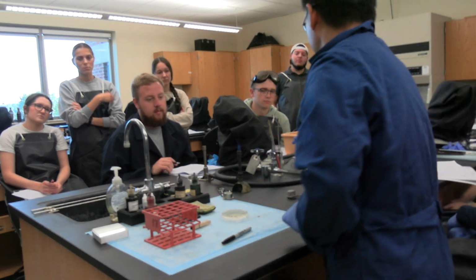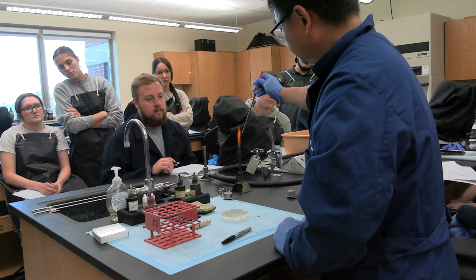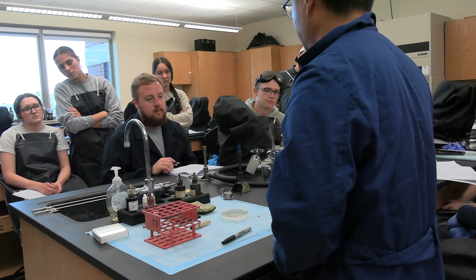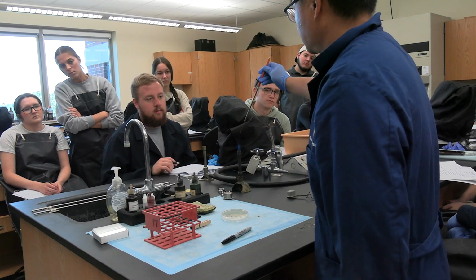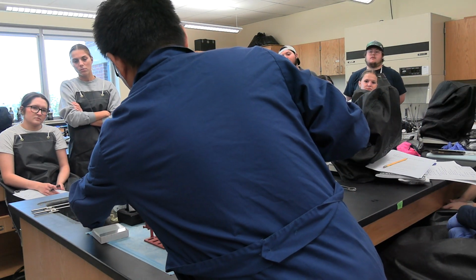Now using the loop, make sure it's sterilized. Flame it like this, at a 45-degree angle, a little bit on the top. This is not correct. Some people do it like this. No, that's not correct. The whole thing. Now what we do?